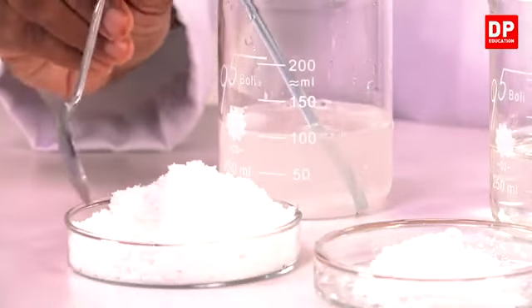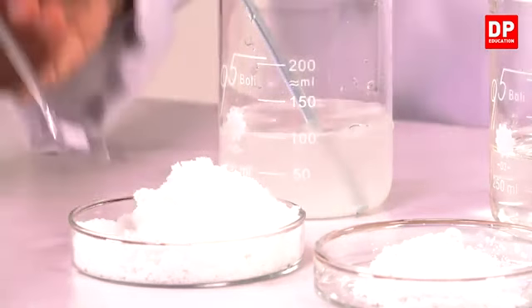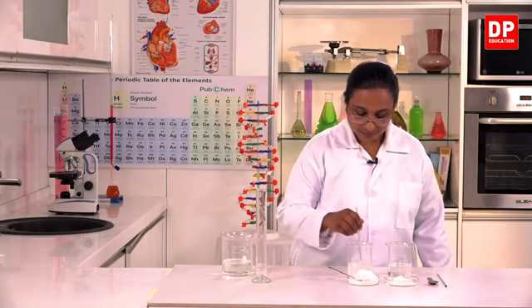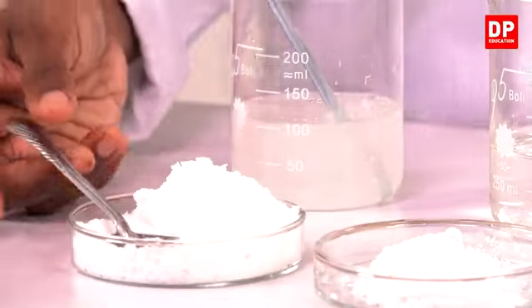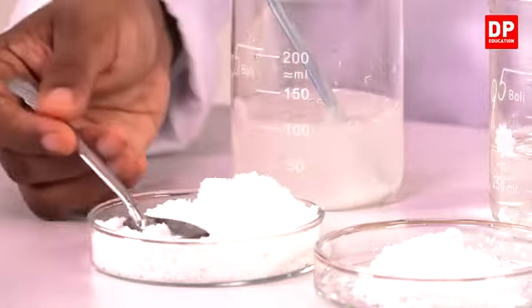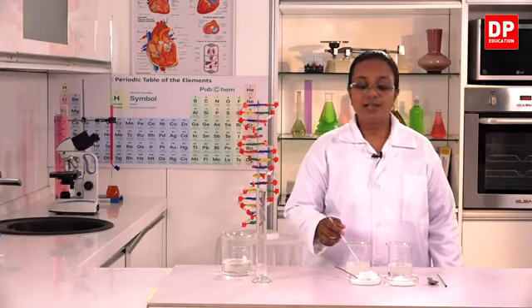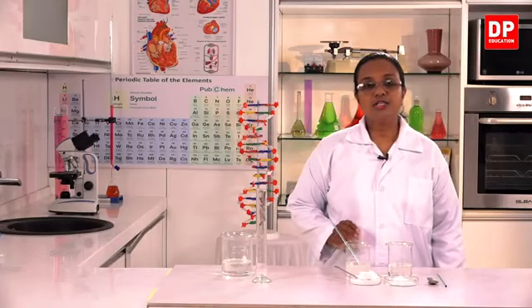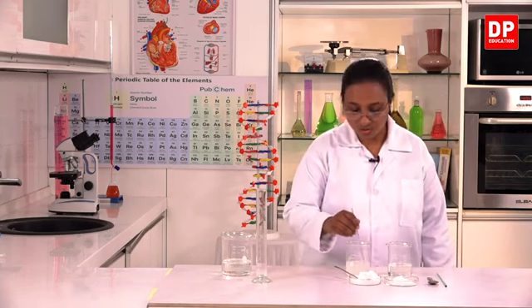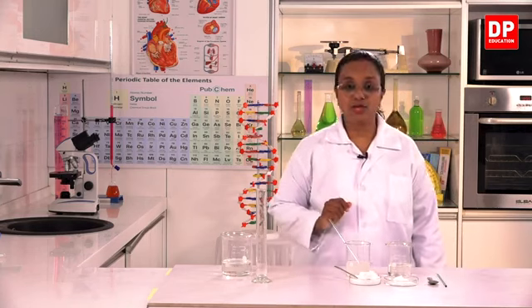So to this again, I'll add another spoonful of salt. One more. I will leave this solution to stand for some time, and with that time, if there is any more solute, that will also dissolve. If not, before comparing the results, we can dissolve it again.